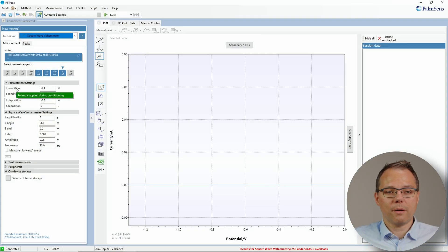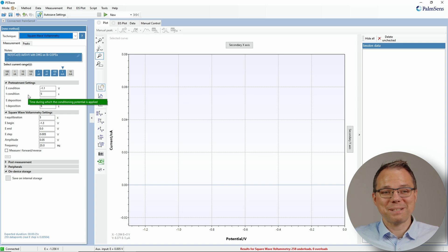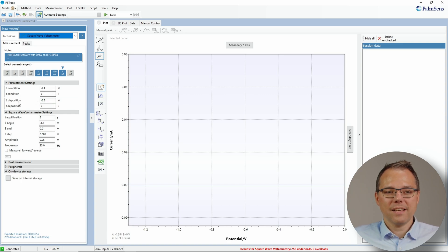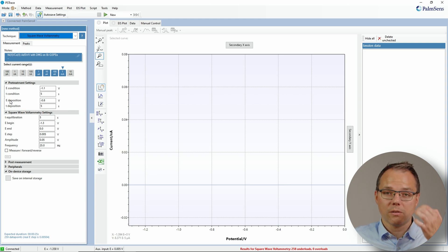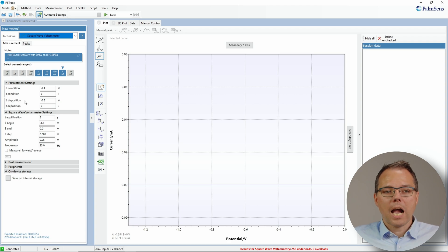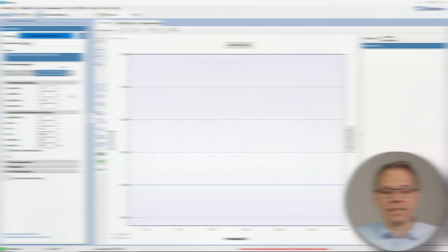You enter an E-condition — for example minus 1.1 volts — and a t-condition, which is the time that E-condition is applied, for example five seconds. Then you have an E-deposition, which is the potential at which you deposit whatever is in your solution, and t-deposition is the time for which E-deposition is applied. That is actually all you need to do to have a stripping technique.